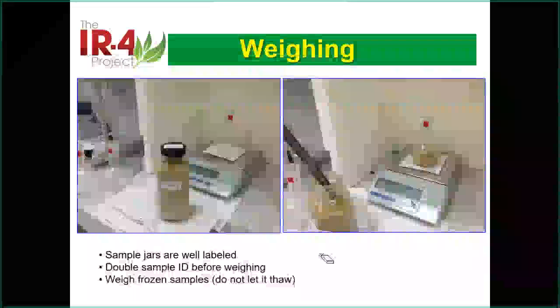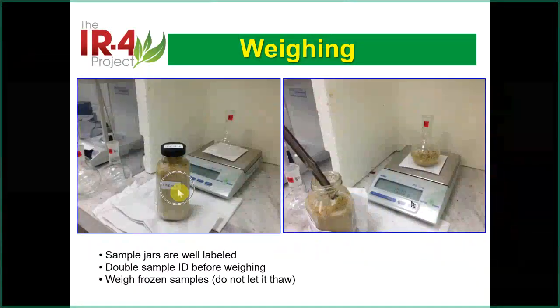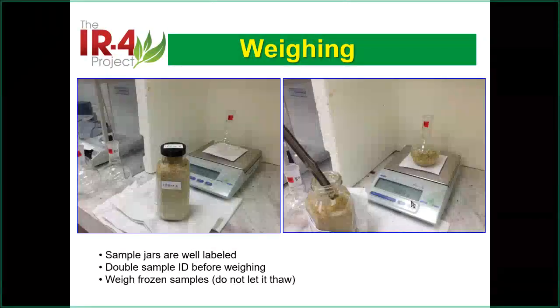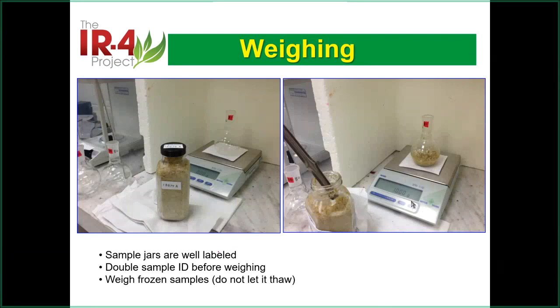Okay, now you put the samples there. The sample is frozen, so don't let it thaw. Don't wait for room temperature. Because it's cold, you will see a little bit of condensation, some water on the surface. That's okay. Do it immediately. Don't wait. I know the reading here will change if you leave it there. Now we weigh exactly 10.00 gram.